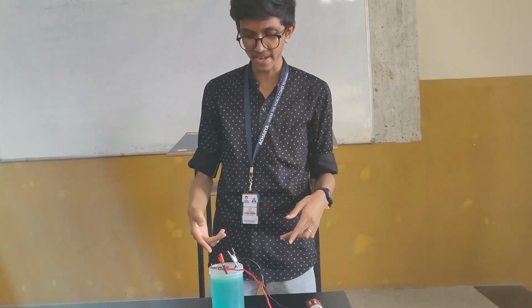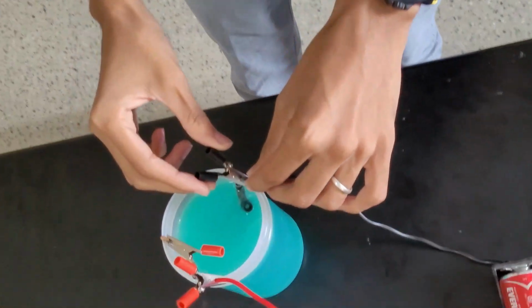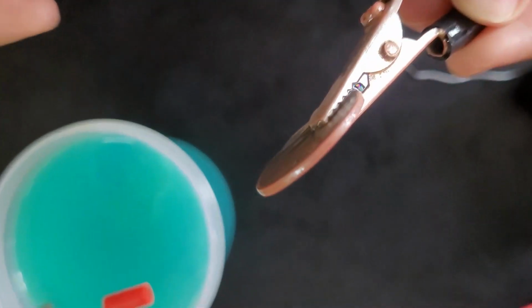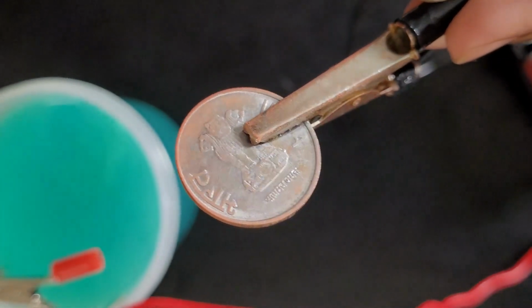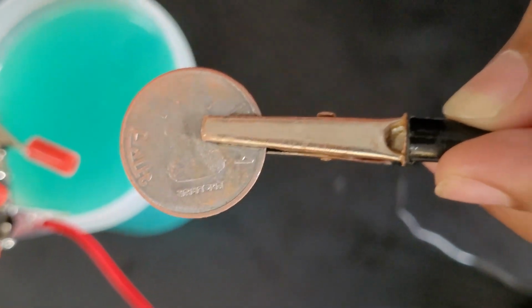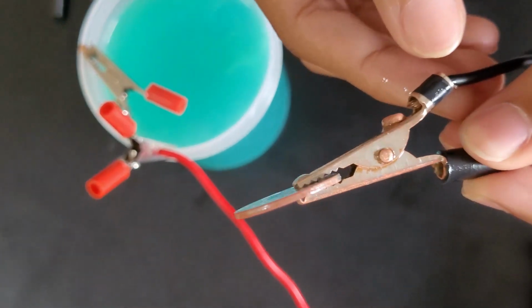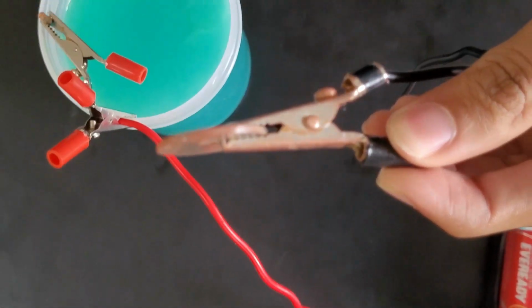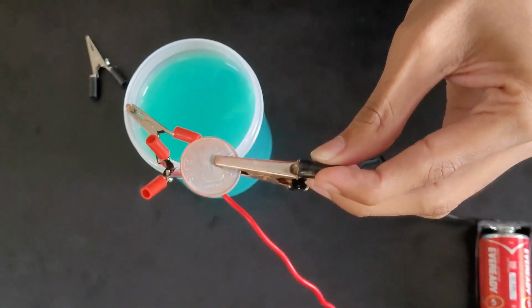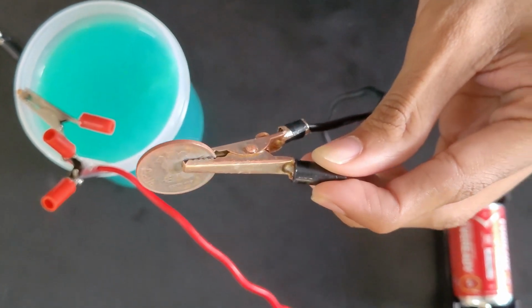Time has passed since electroplating started, so we'll now have a look at the end product to see how the product is done. So as you can see, the coin has been electroplated with copper. You can see the surface of the coin has been covered with copper, and even the metal clip, as you can see, has turned brown, which is nothing but the copper that has been electroplated on the clip as well. So this is how electroplating works. I will put a side-by-side picture of the before and the after to show you how the color of the coin has changed.